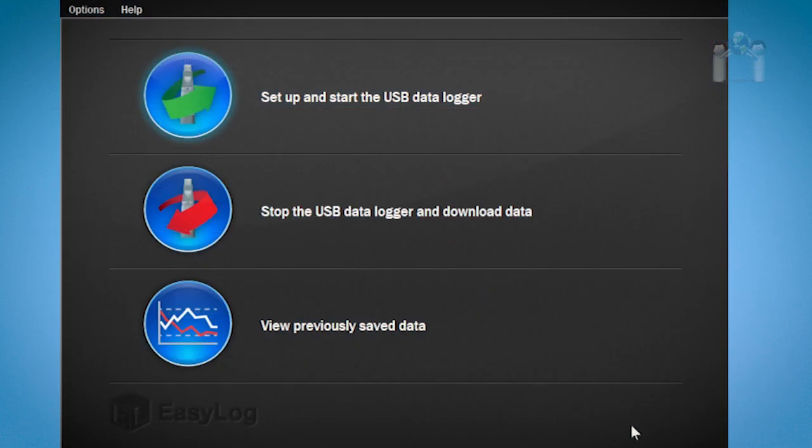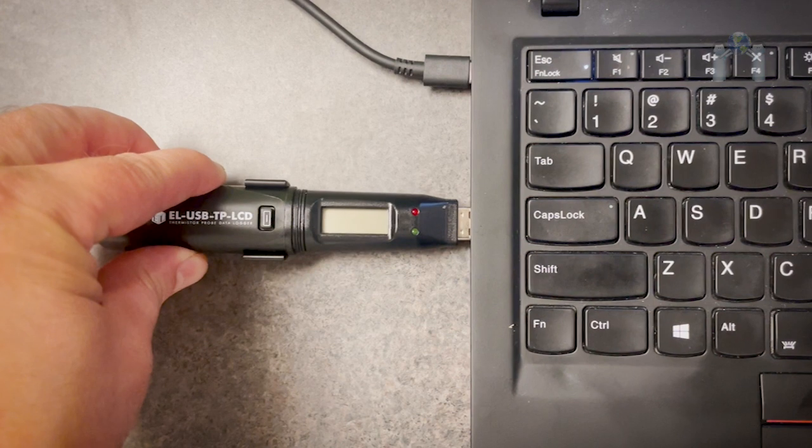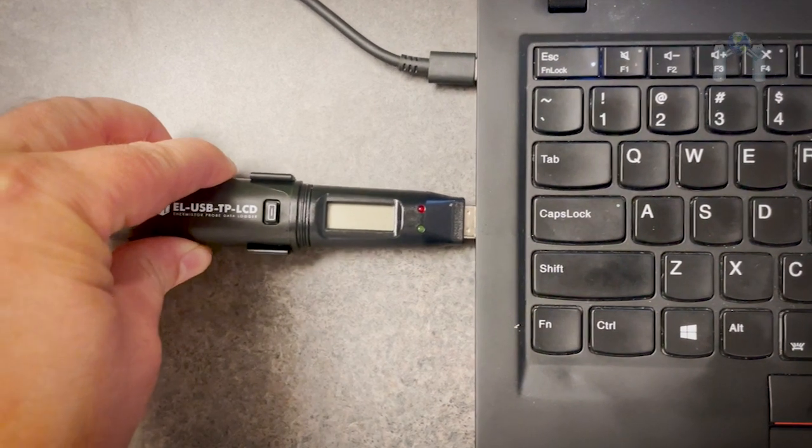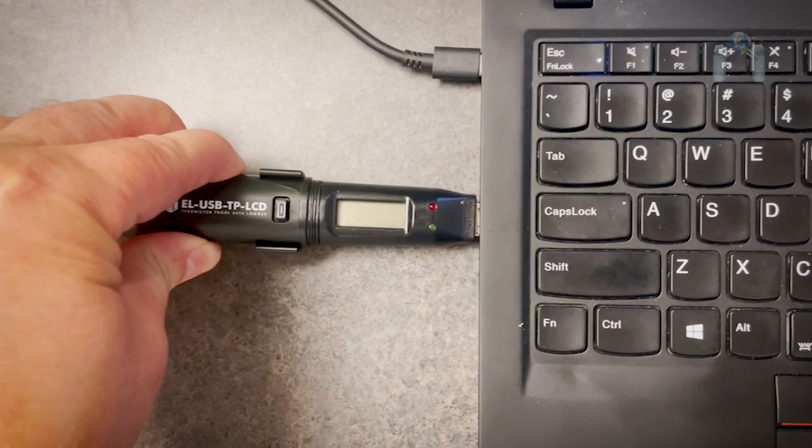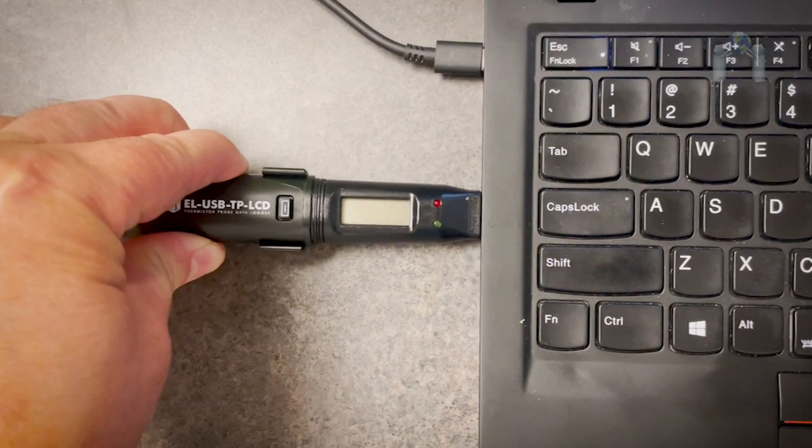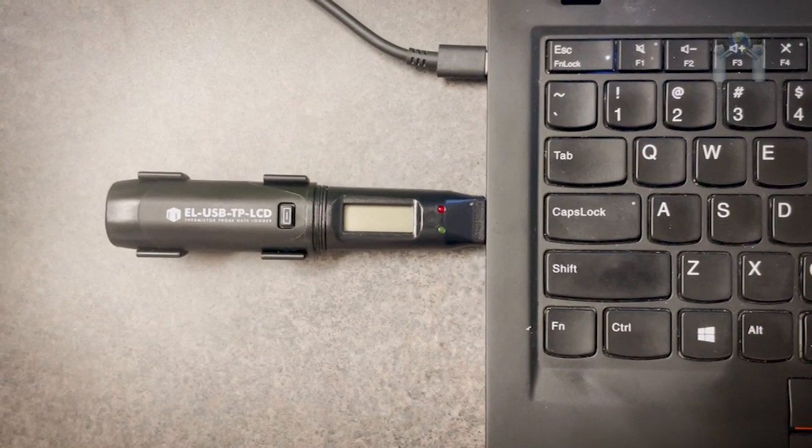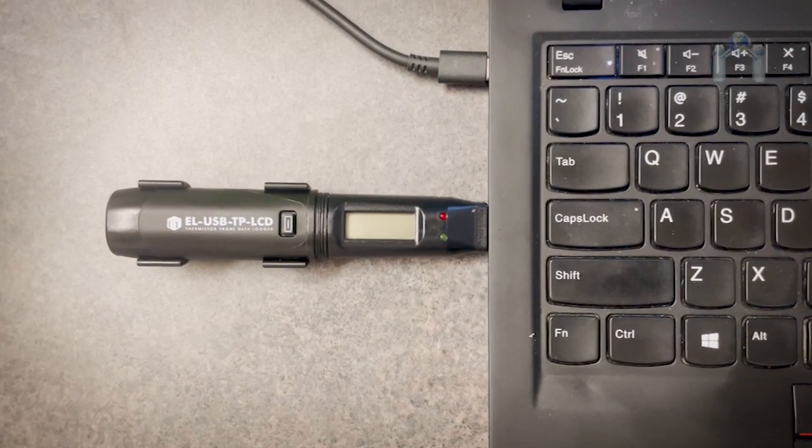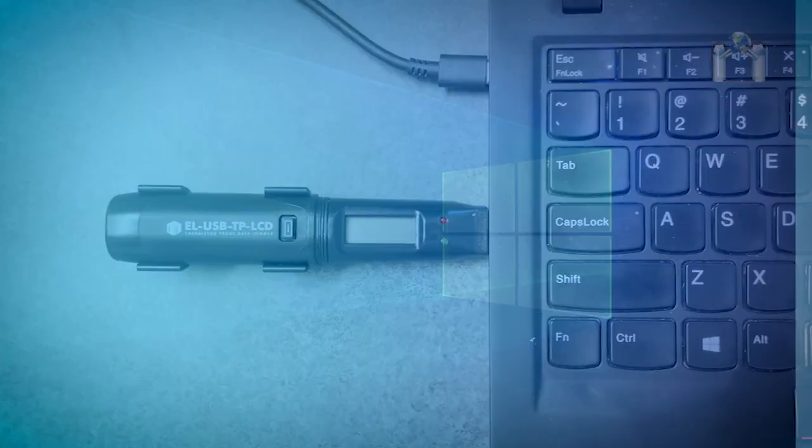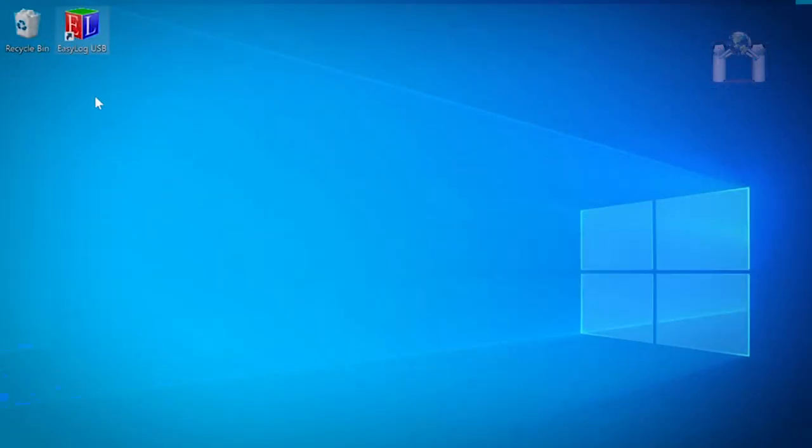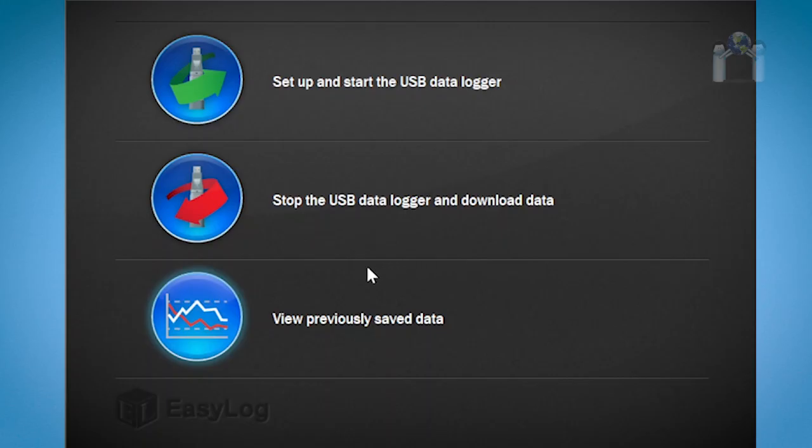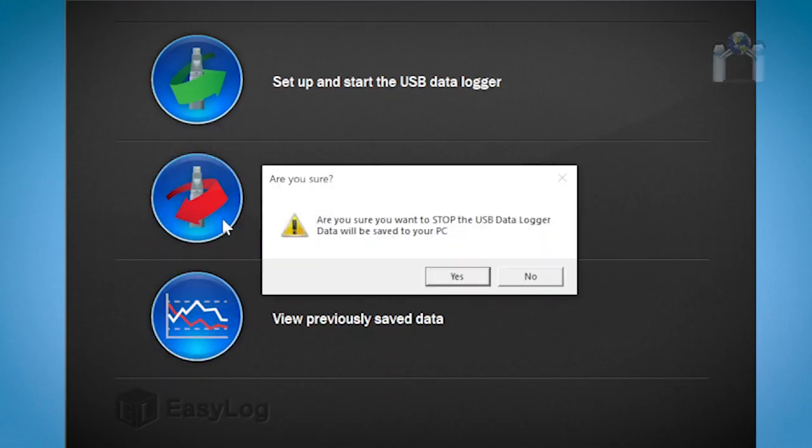You can download the data from the data logger to your computer at any time. Remove the cap from the data logger and plug it into the USB port on the computer that has EasyLog USB installed. After launching EasyLog USB, select stop the USB data logger and download the data.